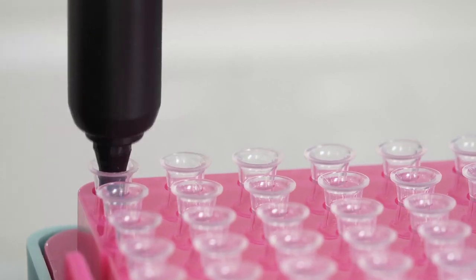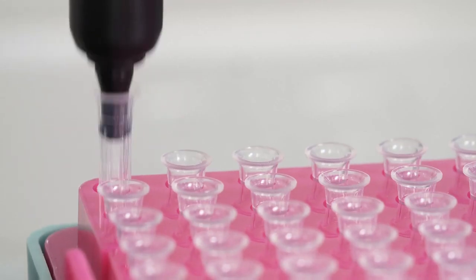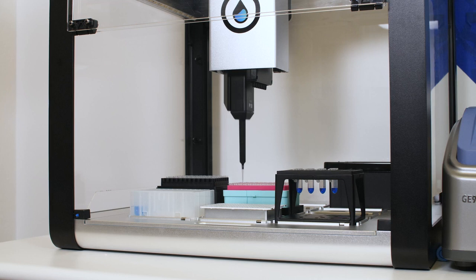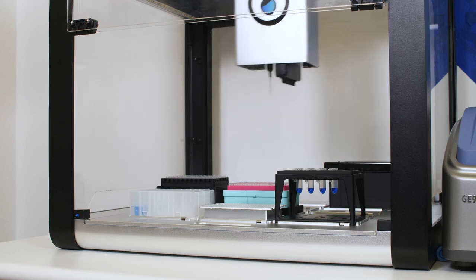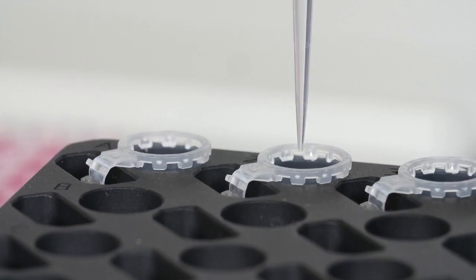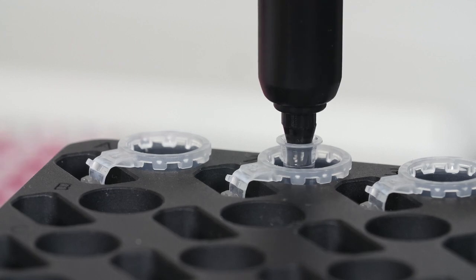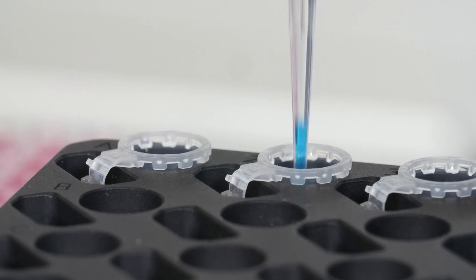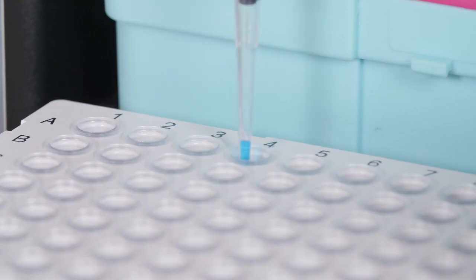The OT2 will start by distributing MasterMix into your reaction plate or PCR-8 strip, and then mix your samples with the MasterMix, potentially saving you and your team hours of repetitive pipetting every week.